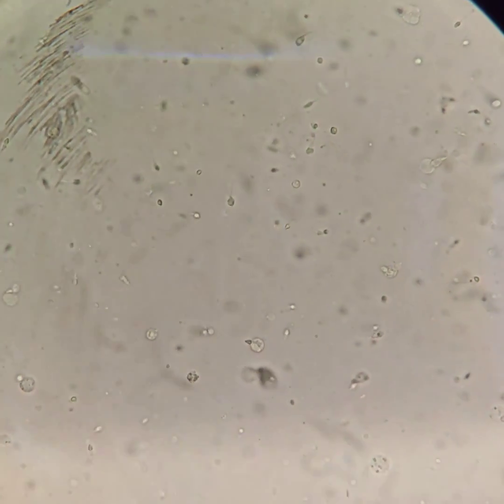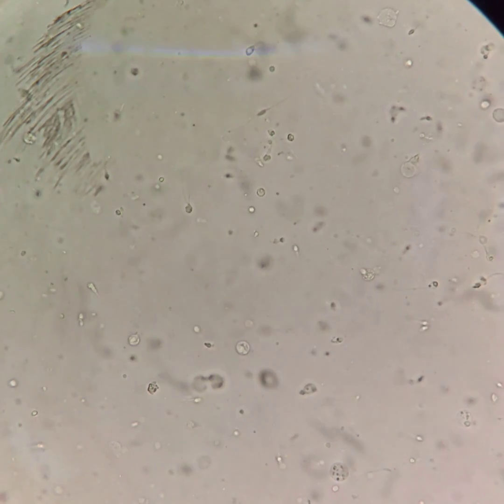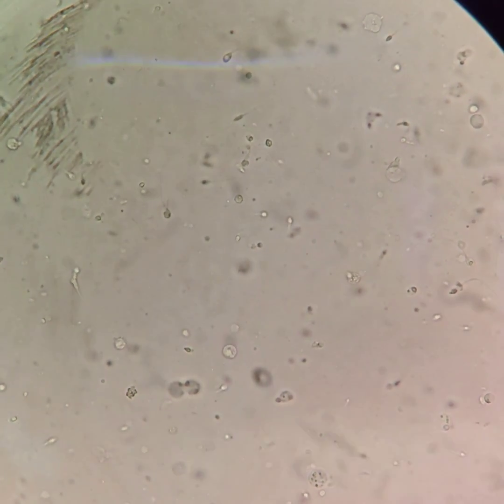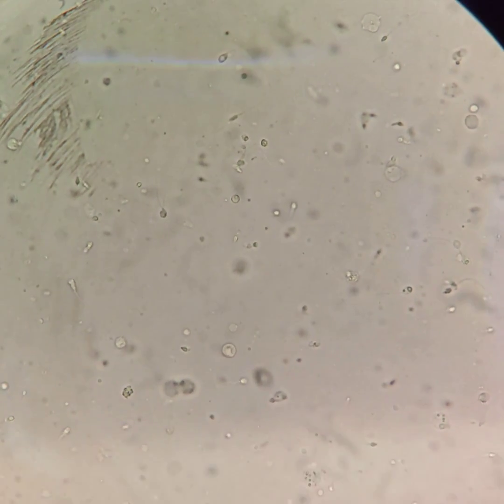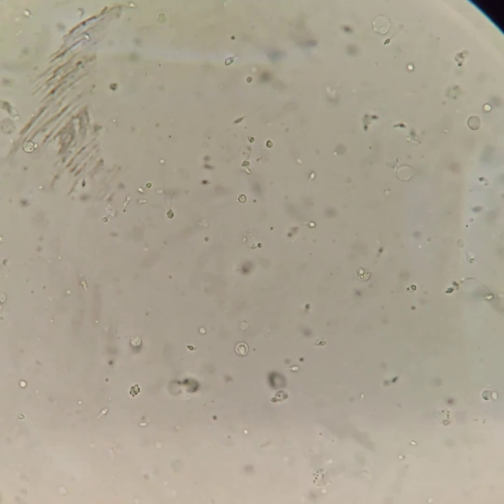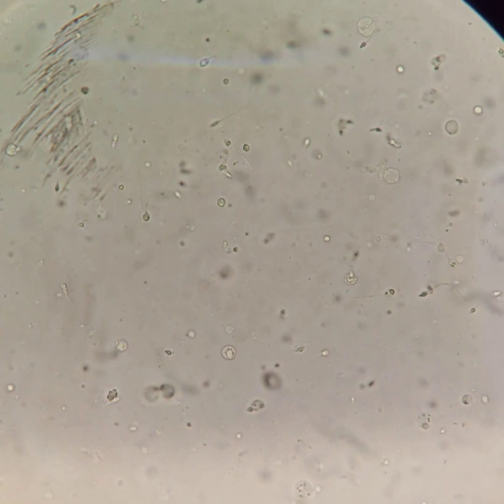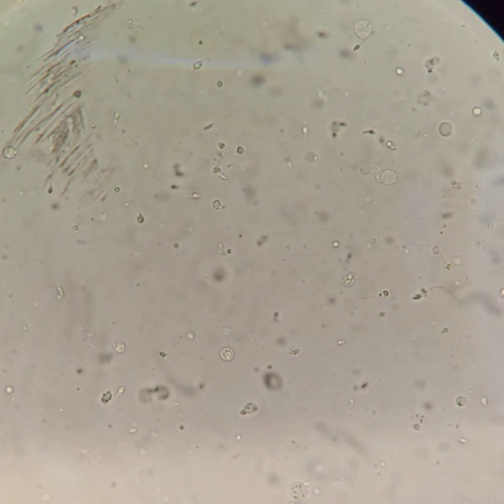To count total sperm count, formula is count one sperm as 1 million. The average sperm count in these fields are approximately 44. That means the total count of this sample is 44 million per ml.